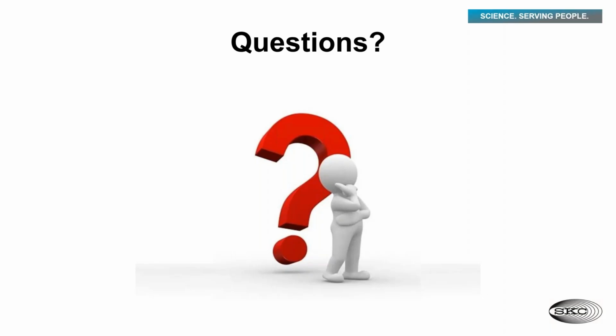Thank you, Dusty. Next one is, how difficult is it to reload the PPI and be sure that you have not affected the pre-weight of the filter?